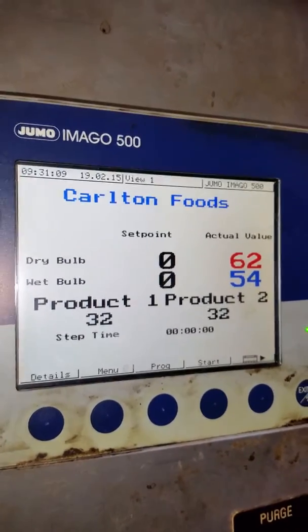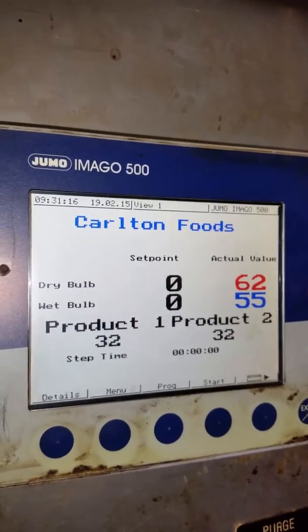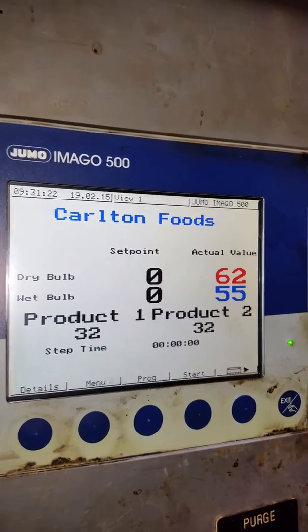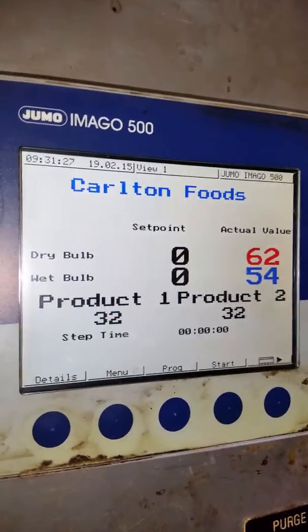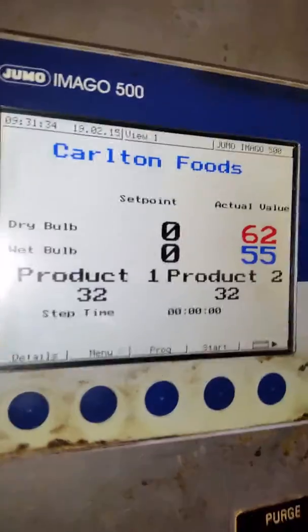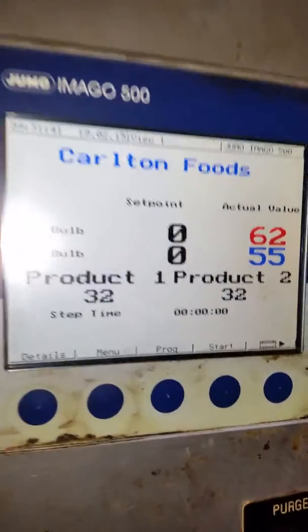We're good to go. While we're looking at this, you'll notice that now we have a difference between our dry bulb and wet bulb probes, because one of them has a wick over it hanging down in that water, so it's measuring a different temperature. How often are those wicks changed? Depends on how often you're going to run products using humidity. If you're using humidity every day, change these socks every day.